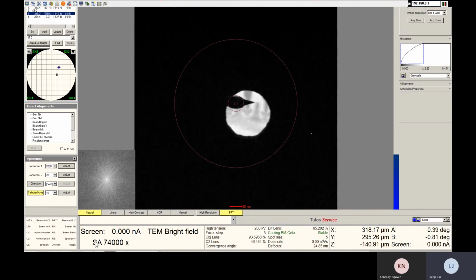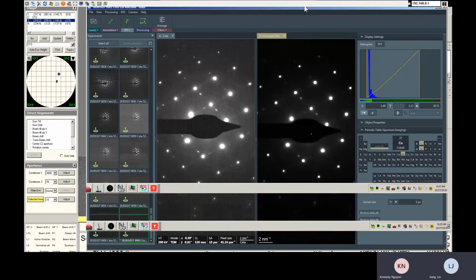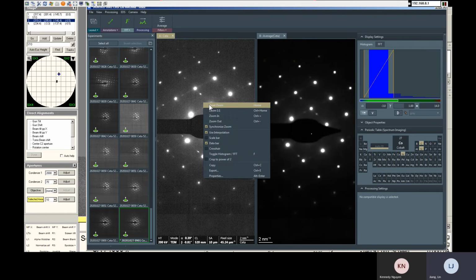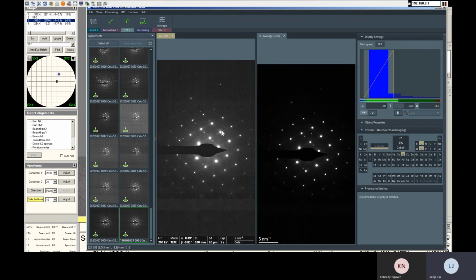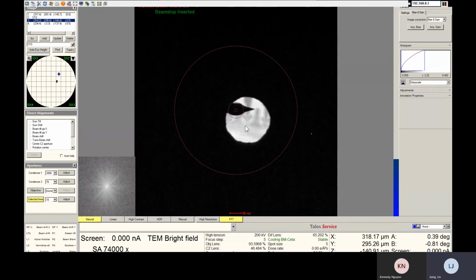This region you see some elongated diffraction here. You see they're almost connected with each other. That indicates the stacking fault feature. But right now we still got a lot of interference from the matrix, because this pattern is made from the matrix, because the aperture is still too big, right?